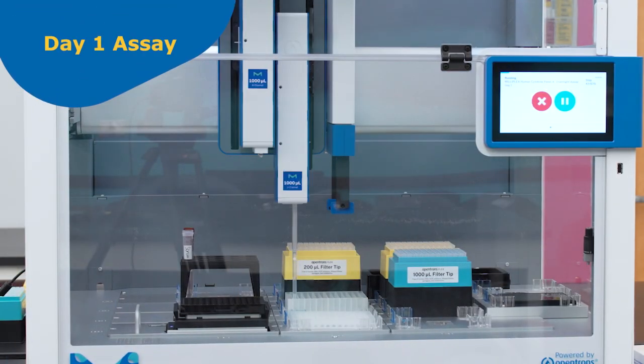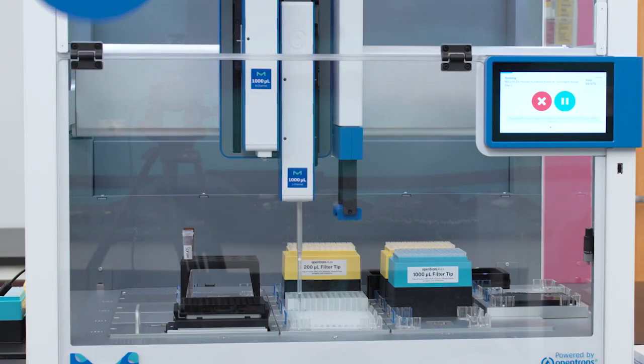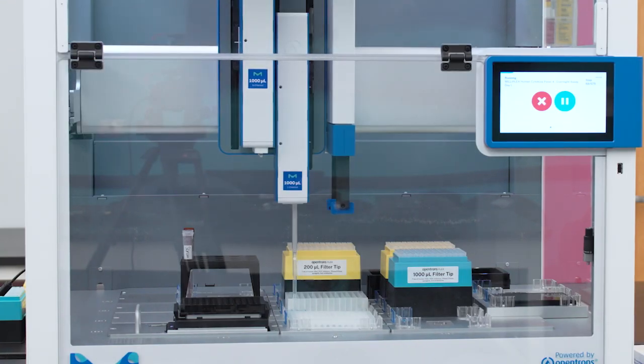First, the AAW workstation will make the standard curve by dispensing assay buffer and then mixing standards 2 through 6.